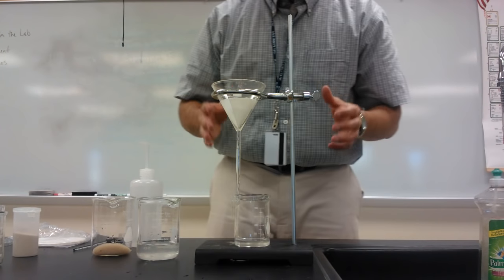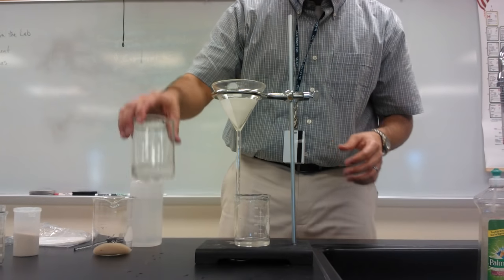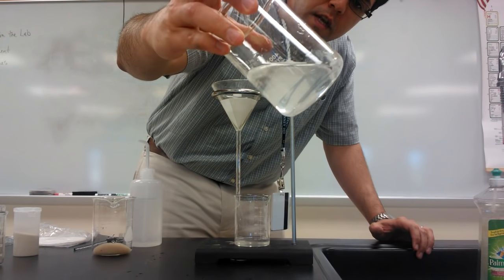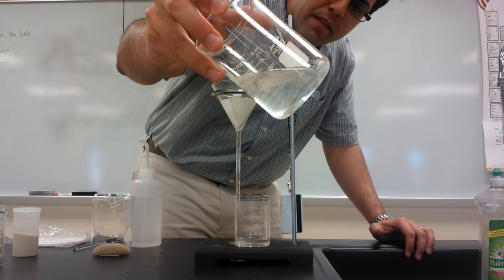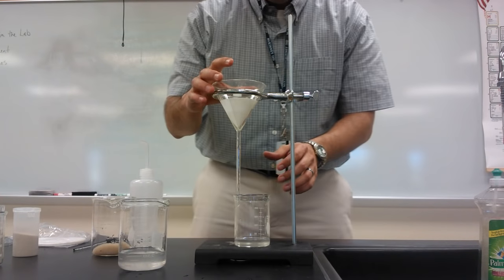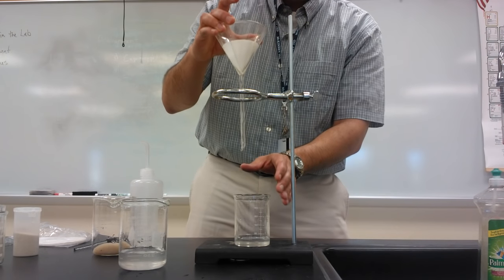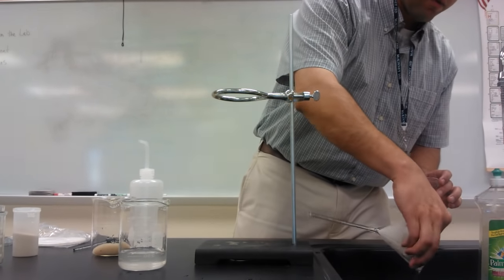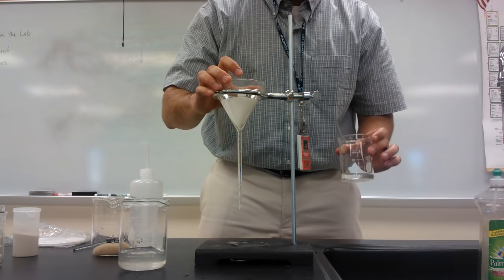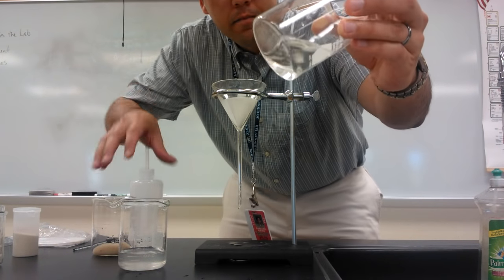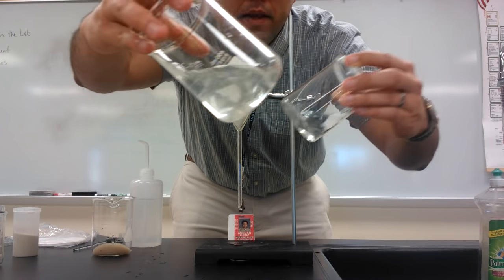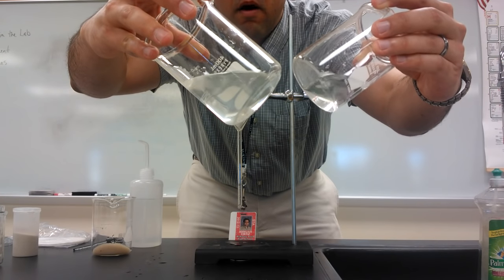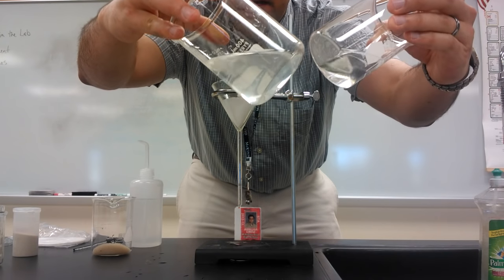The filter paper we're using is very fine, and so it does take a while for the liquid to come down. So if we ever do this in class, you've got to be aware that this process takes some time and you've got to be patient with it. Notice that this liquid is kind of cloudy — it shows us that there are some small particles still suspended in the water, some particles of sand. I'll pour this out and show you the difference. You can see how this water is much more clear than this water — this one's cloudy, this one's clear, and this is the water that has been filtered. The filter has been able to catch those smaller, finer particles of sand that were still suspended in the water.